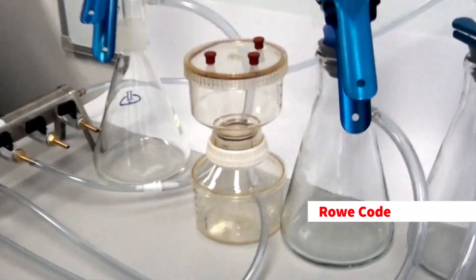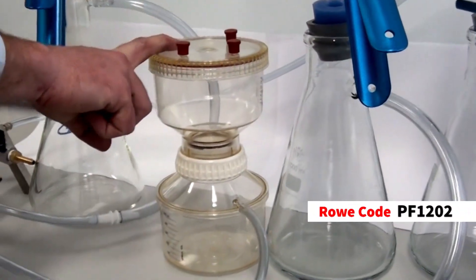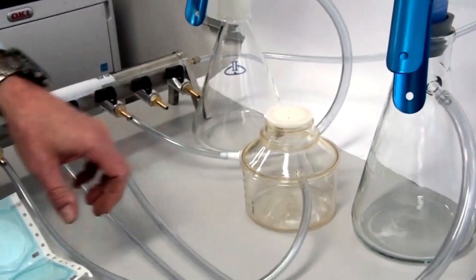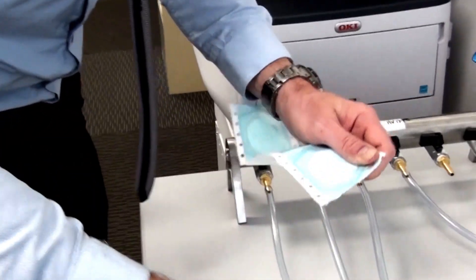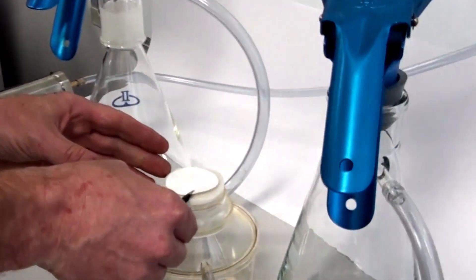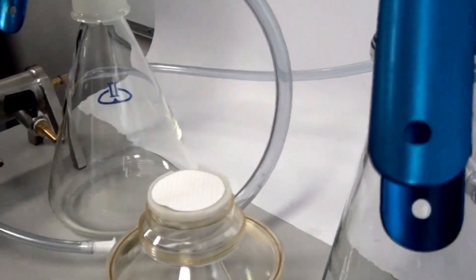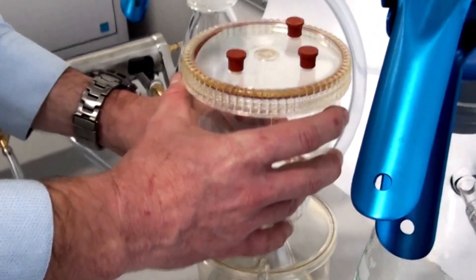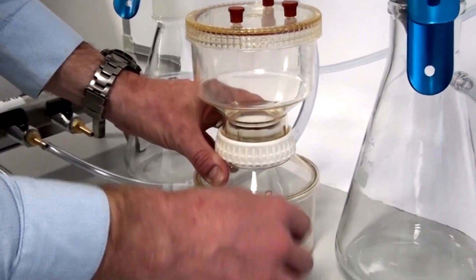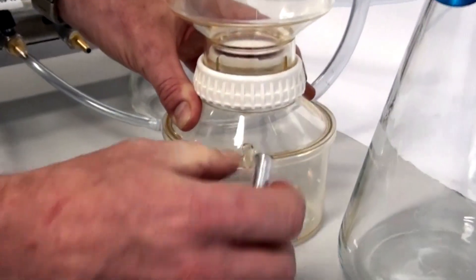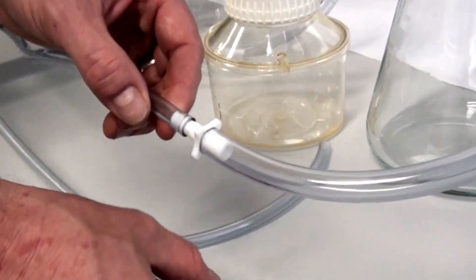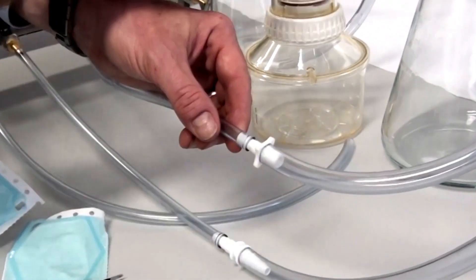Okay, now next to that we've got the Tarsons PF1202. That just screws apart like so. Membrane just sits on there. And screws back into place. Now, this is the PT2800 tubing. So that is a 6mm OD fitting there. And it actually also comes with this piece here, which I've had to use because I've run out of these connectors here. So that comes standard with the PF1202.